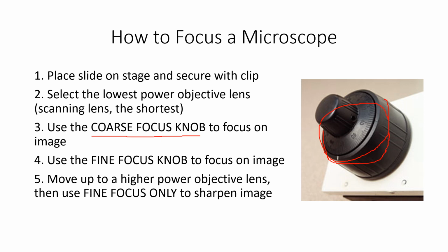The other knob that's available is the fine focus knob. And again, it's safe to use on any power lens because it only moves the stage a tiny bit. But it's typically used after the coarse focus knob has already been adjusted on the lowest power lens.